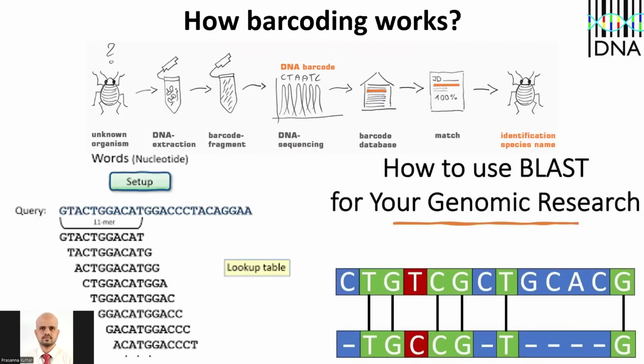I'm not a zoologist. I'm not an entomologist. I don't know what species it is, but using the DNA barcodes, just by comparing the sequence in the database, I can do it. What does comparing the sequence in the database mean?